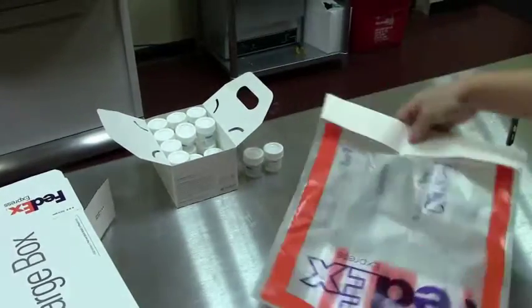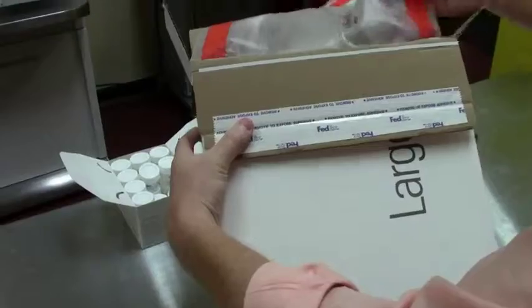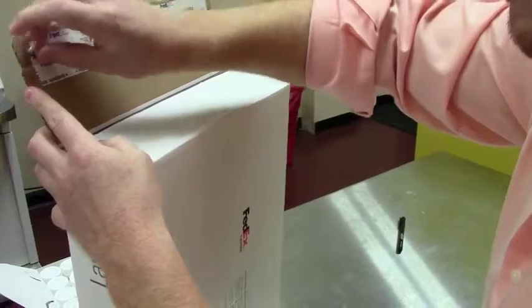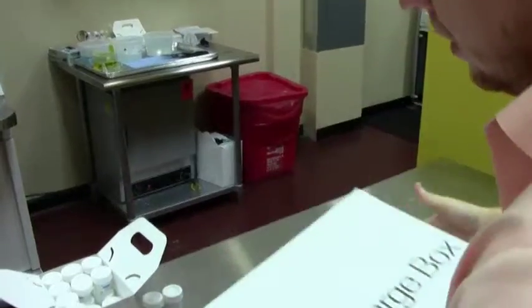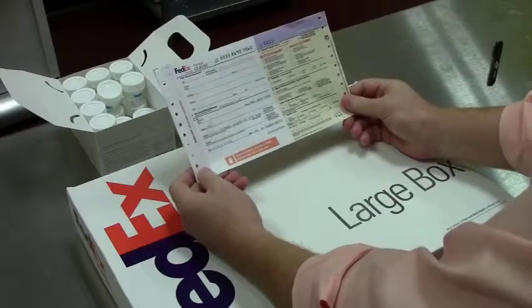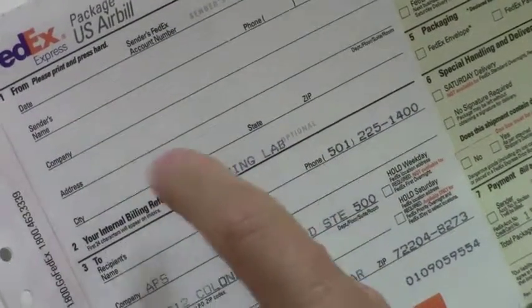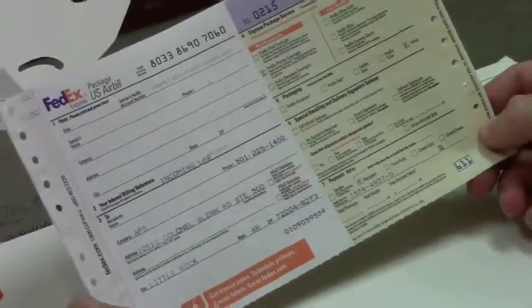Once this package is sealed up, you then will place this in one of the FedEx boxes. Go ahead and close the box up. Remove the adhesive seal and seal the box. So once you get the box sealed up, then you'll take the APS FedEx shipping form. It's already been prepaid. All the information's filled out. The only thing you have to do is put the date and your company information, and it will get to APS lab the next morning by 10:30, which is priority overnight.